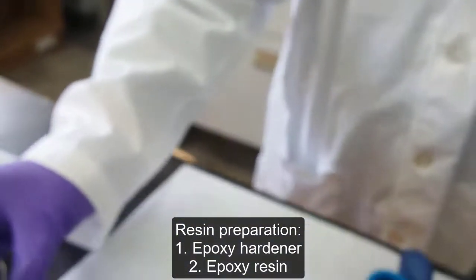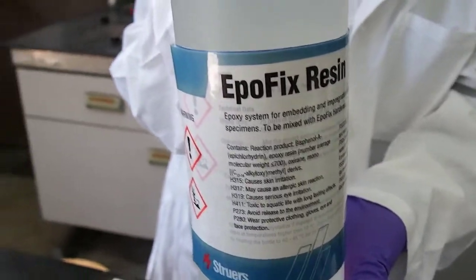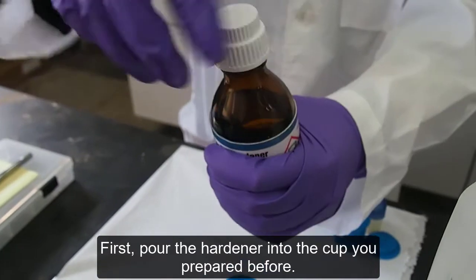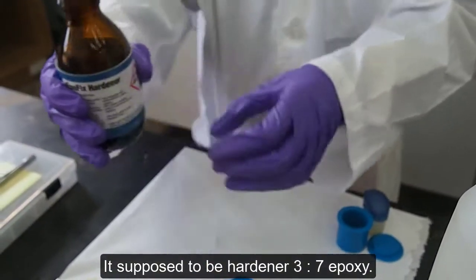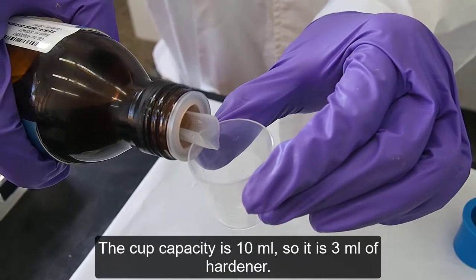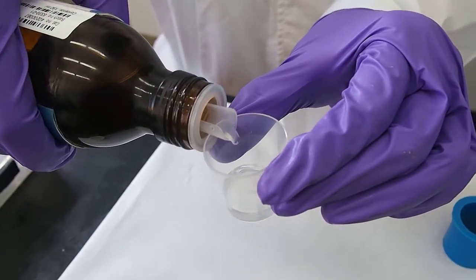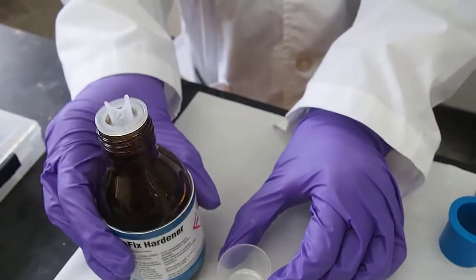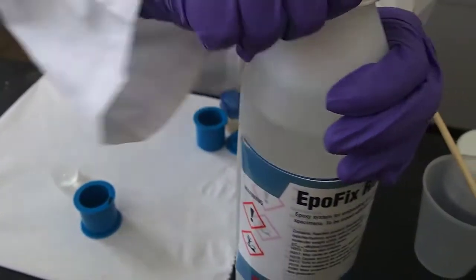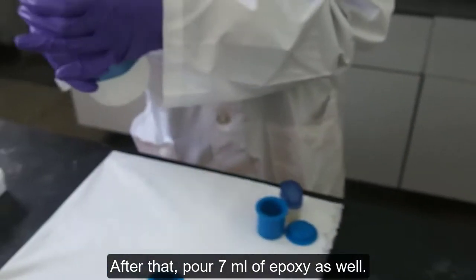Resin preparation: you need epoxy hardener and epoxy resin. Pour the hardener into the cup you prepared. The ratio is 3 to 7 — hardener to epoxy. The cup capacity is 10 ml, so use 3 ml of hardener. After that, pour 7 ml of epoxy as well.